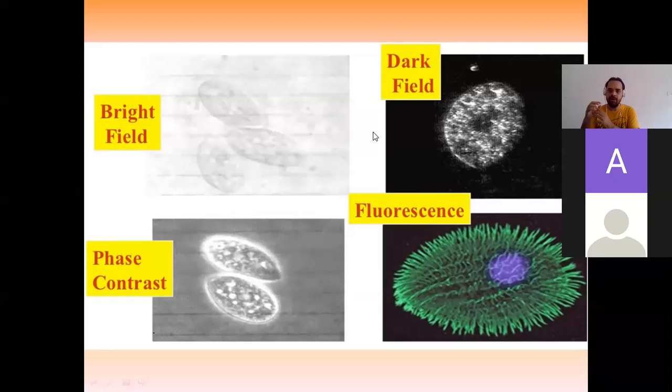So whatever sample we are placing into the fluorescence microscope, when we are observing the specimen, the image that we get will be a little bit delayed. Once you place the subject and focus your light, you cannot get the result instantly, or the image will not be formed instantly.